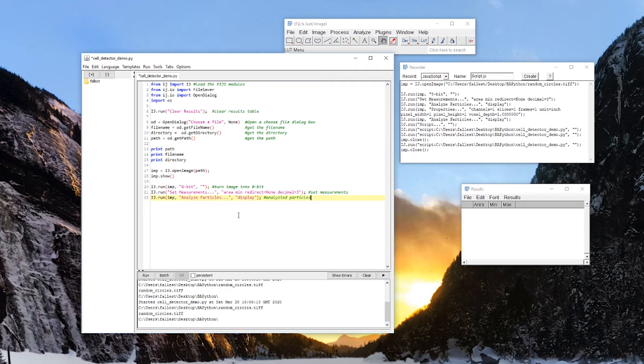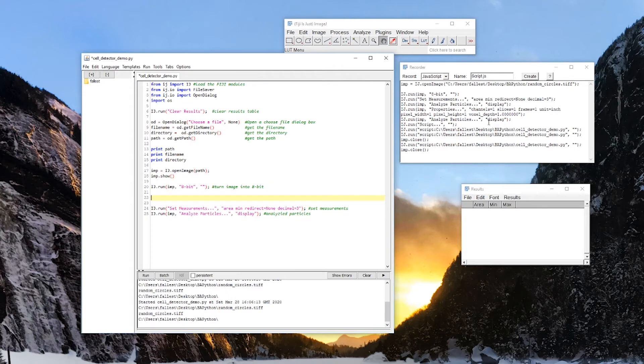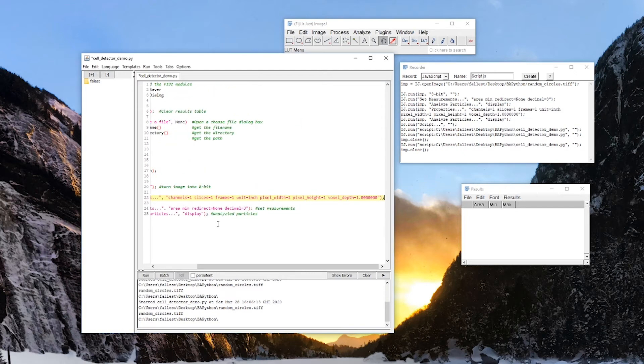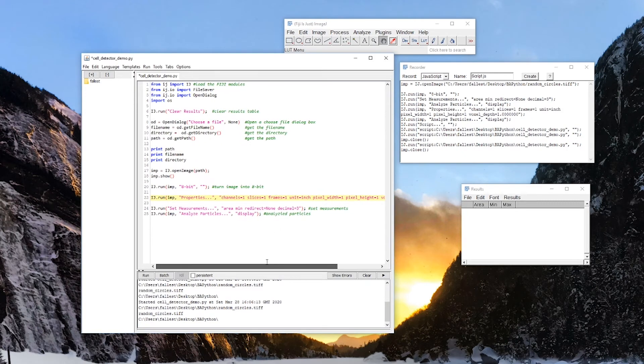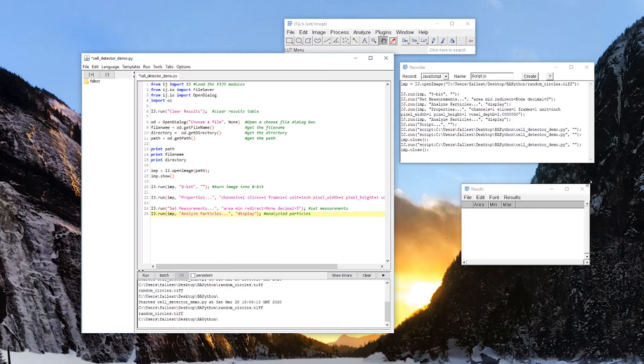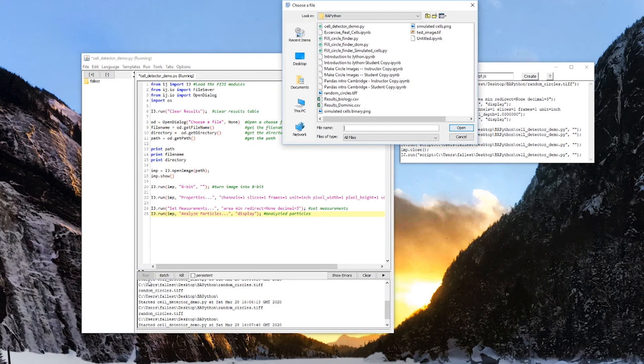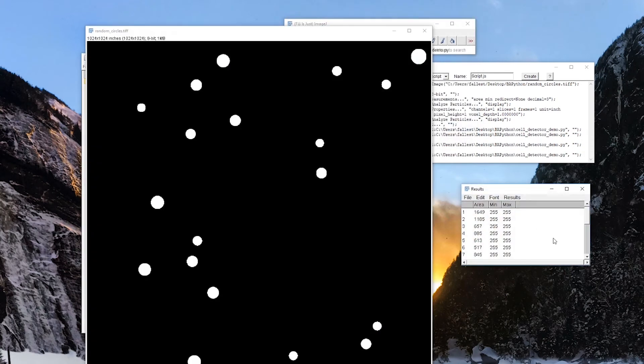Now, let's see. What did we make a mistake of here? That's going to open that up with the wrong size, pixel size, rather. And so we can change this to change the pixel size so that our measurements are in the right units. And let's close this window and test it. RandomCircles.tiff. And we get our measurements out over here.